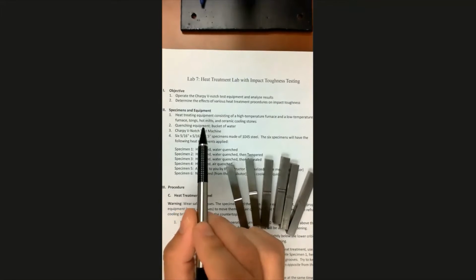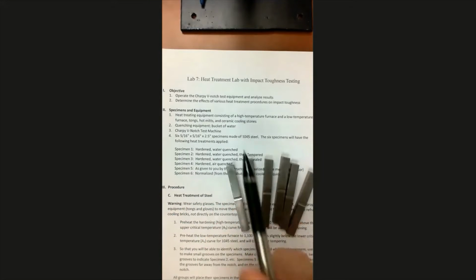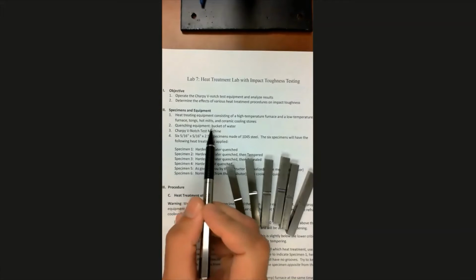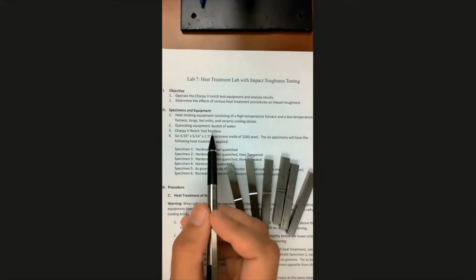Because they're so hot, we're going to need some tongs and some hot mitts and then some cooling stones, which are kind of like pumice, a really porous rock, and they don't conduct the heat onto the countertop, which could melt. And we're also going to need a bucket of water for quenching. This is probably my favorite part. I love taking the red hot steel specimens out of the furnace and then dunking them in the bucket of cold water. It's pretty fun. It makes a really awesome hissing sound.